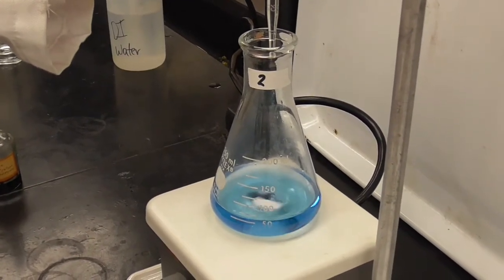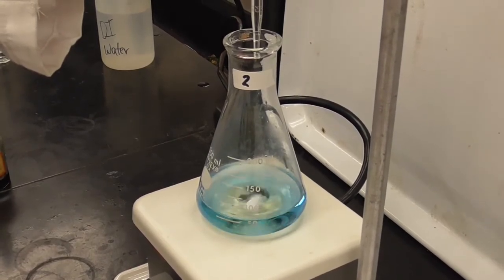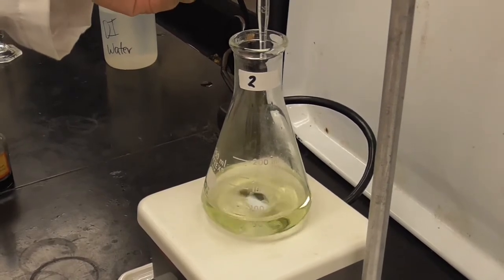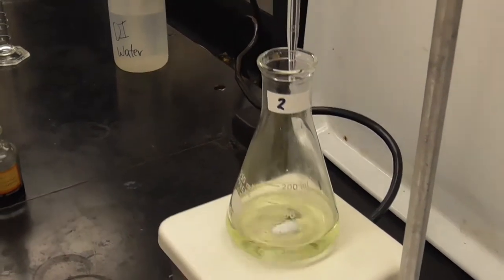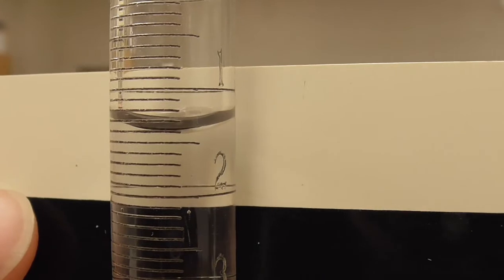So we're getting close to the end point. And so Dr. Dene is titrating. Okay, let's see if that stays yellow. And it looks like it is, so we'll call that done. And we'll go ahead and read this endpoint. Okay, there's the endpoint. Okay, here is the beginning burette reading, the starting burette reading for sample number 3.